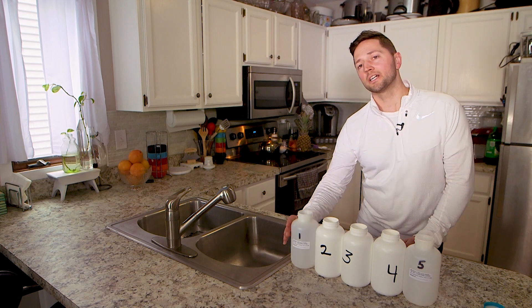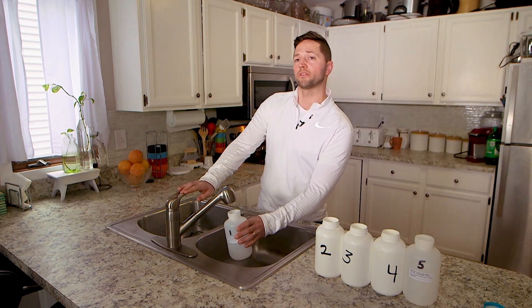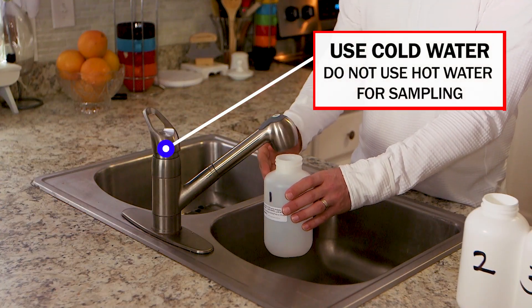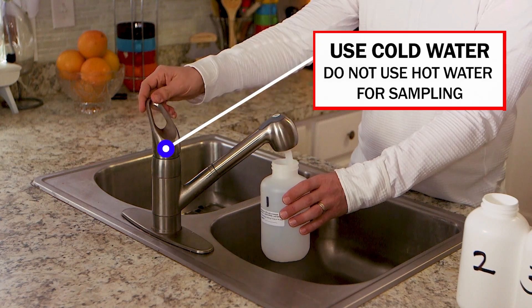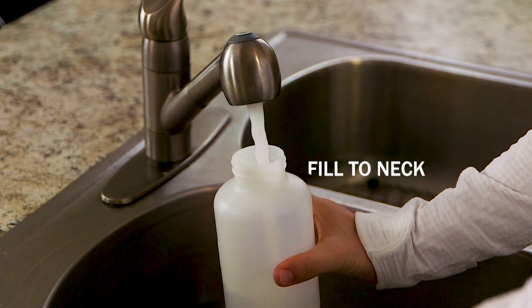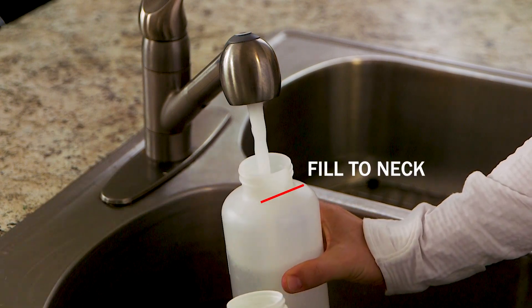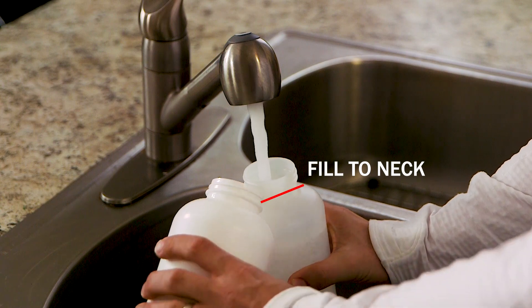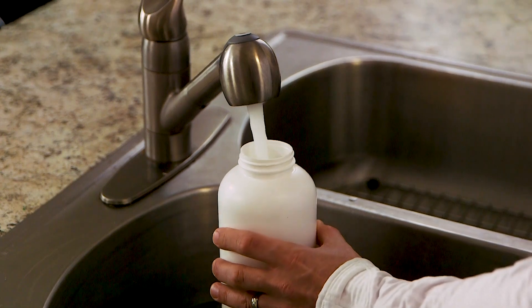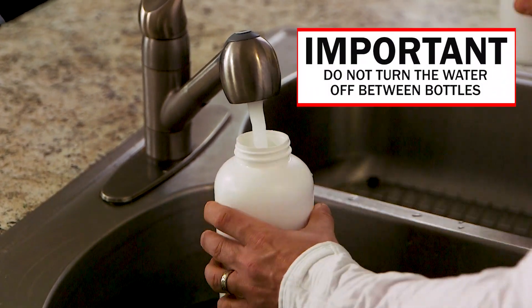Next we're ready to sample. First, grab bottle one and place it directly under the faucet so it's ready to capture that first draw of water out of the tap. When you're ready, turn on the cold water tap. When filling the bottle, do not allow the neck to touch the faucet. As the bottle is filling, grab bottle two and hold it near bottle one. When the water reaches the neck of bottle one, immediately slide bottle two under the water stream. Do not turn the water off between sample bottles. Now fill the water to the neck of bottle two. Fill bottles three through five in the same manner, making sure we capture all the water coming from the faucet.